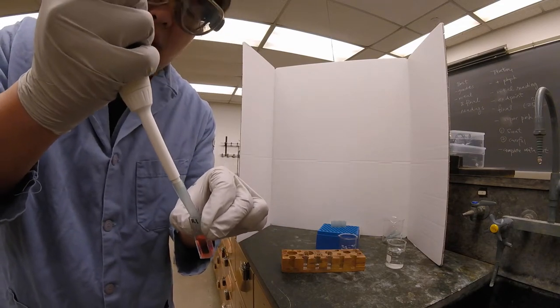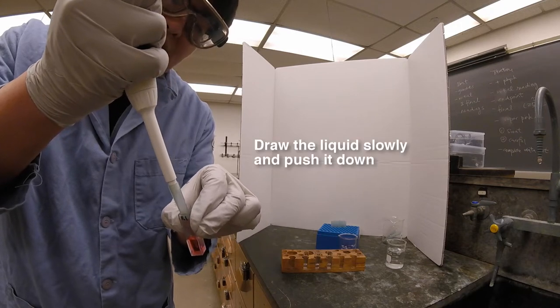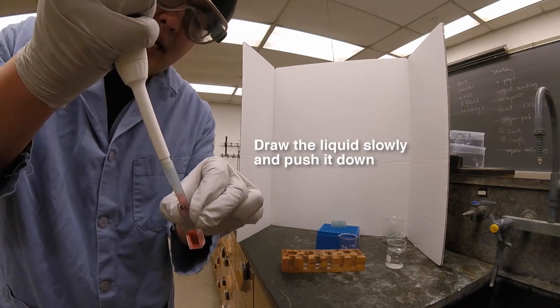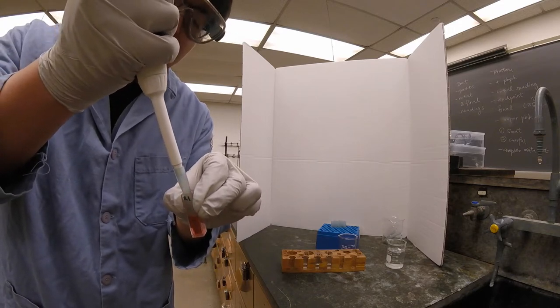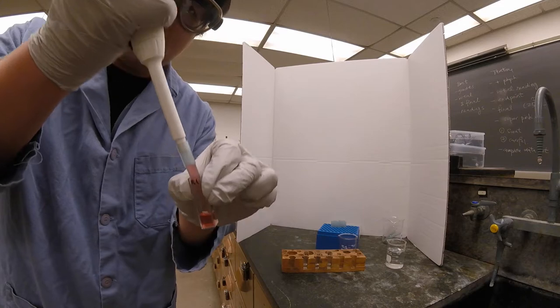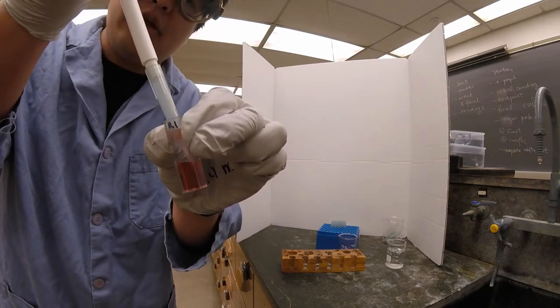When you add the water, you want to draw up the liquid again slowly and then push it back down. You don't really have to go to the second stop for this because we're just mixing, but the idea is to get a homogenous solution so that the concentration is even throughout the cuvette.